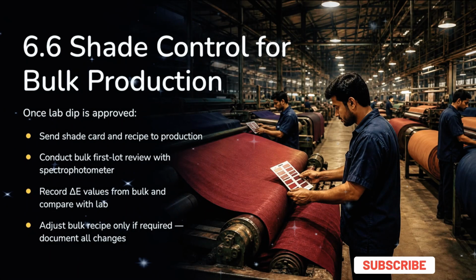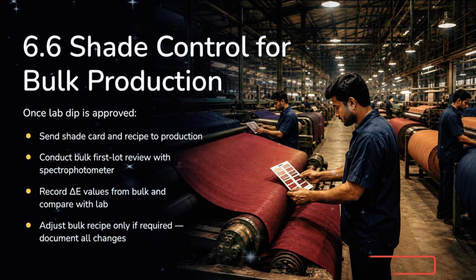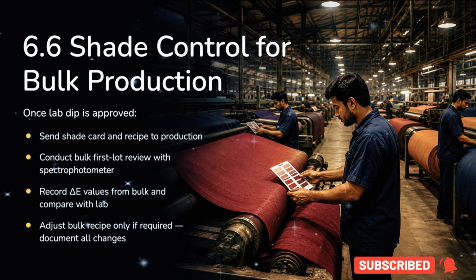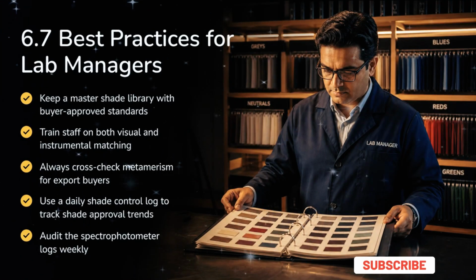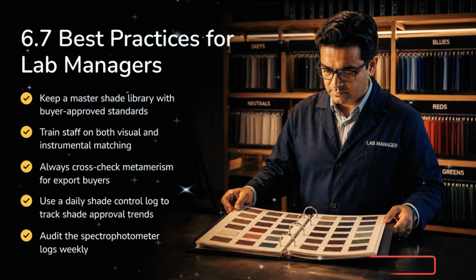For bulk production, send the approved shade card and recipe to the floor. Conduct a first lot review using the spectrophotometer, record delta E values, and only adjust the bulk recipe if necessary, documenting all changes.